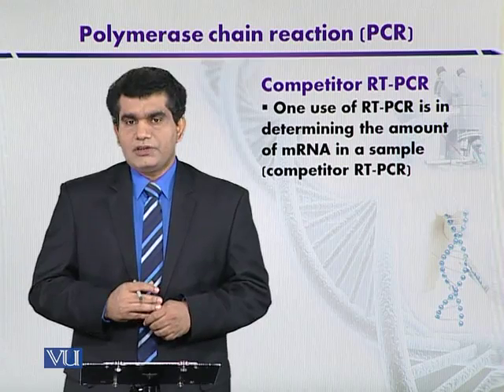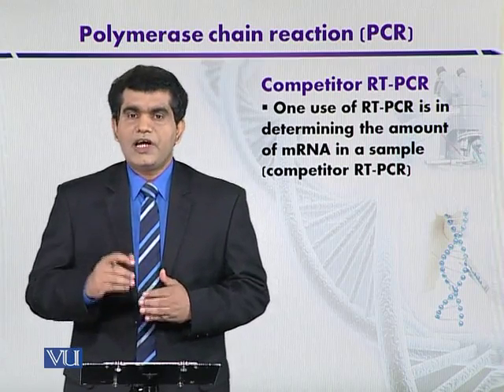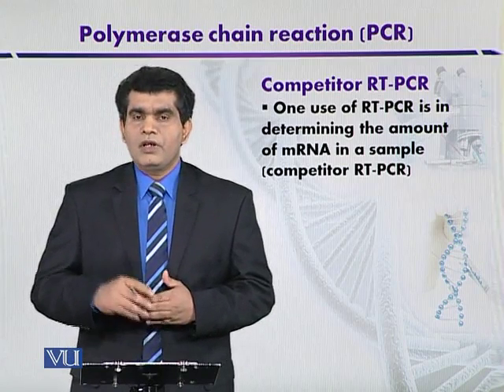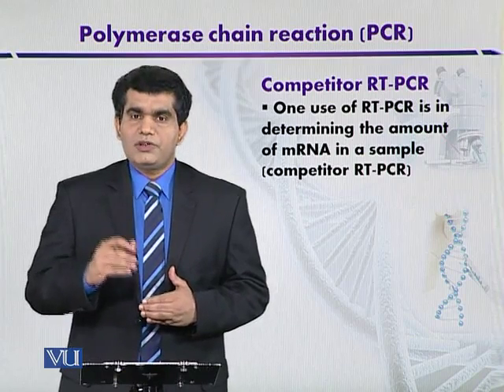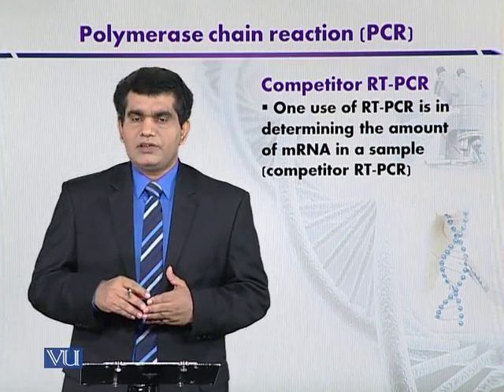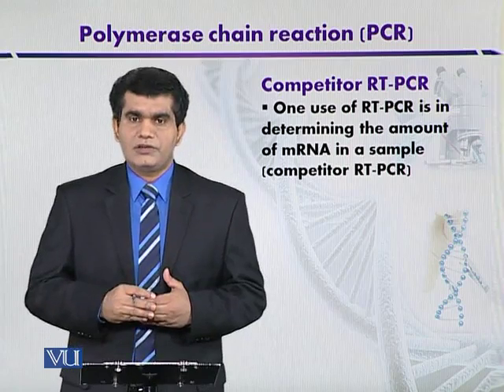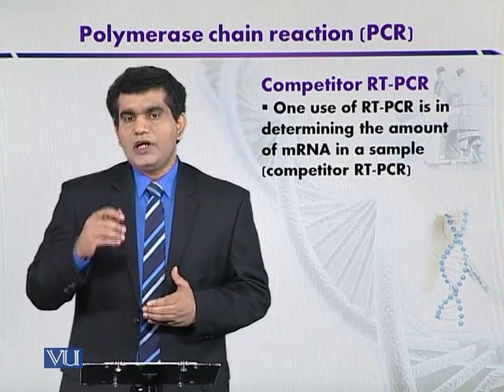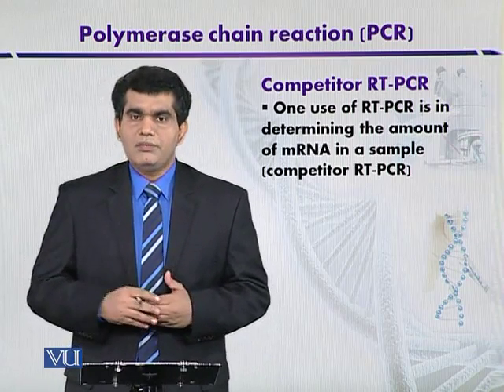One of the application of competitor RNA is that it can be used in diagnostic procedures. That is, when we are going to detect certain pathogens, that may be viruses, like the viruses of hepatitis or other retroviruses, whose nucleic acid is RNA. So for such diagnostic process, we can use a competitor RT-PCR.